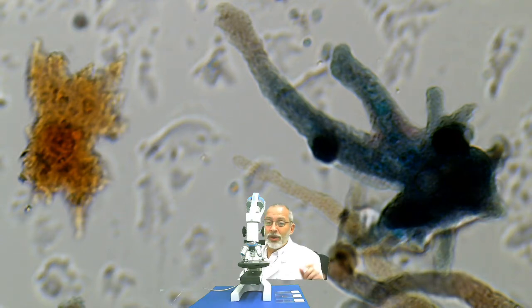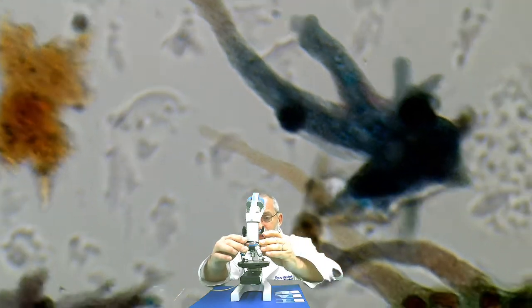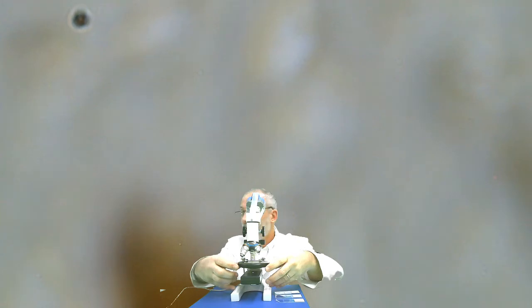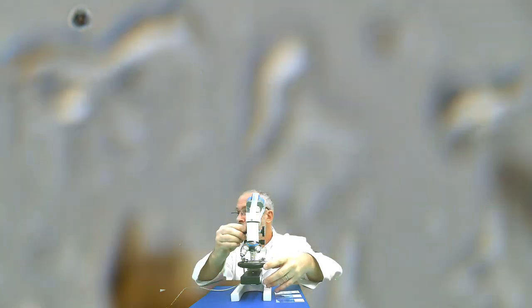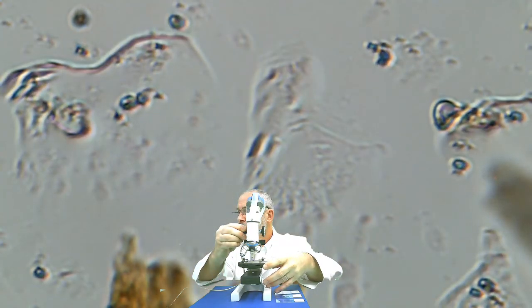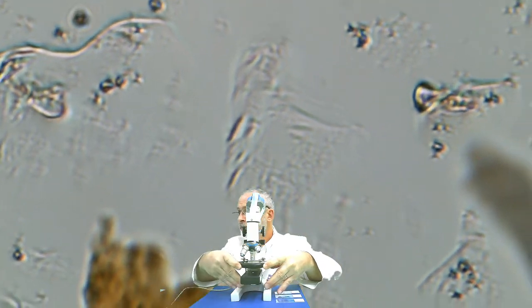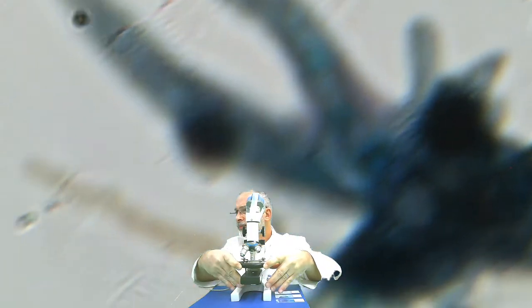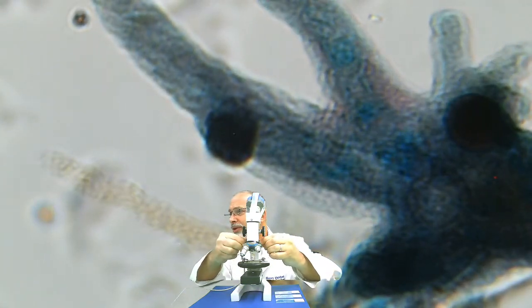And now I'm going to zoom in to the 100 times magnification. And let me find one of our specimens here that we were just looking at. Oh yeah, let's get this one, one that looks like an octopus. Let me get into focus here a little bit more for you.